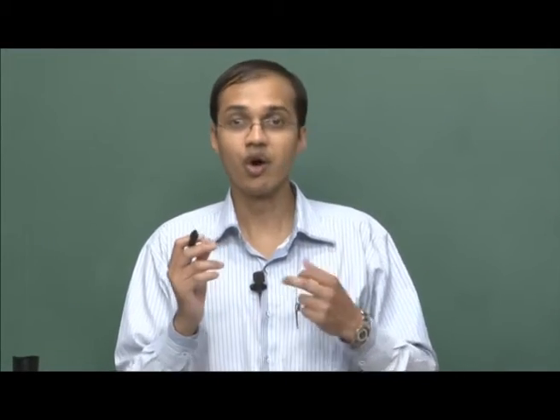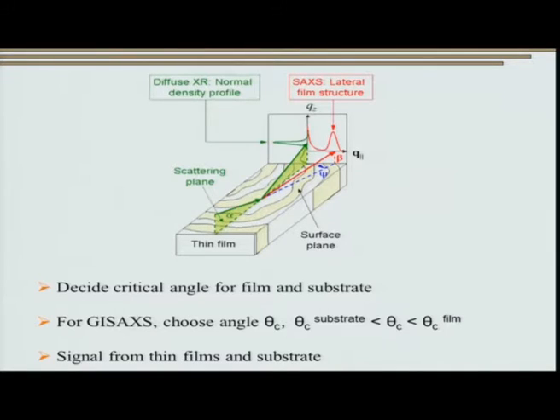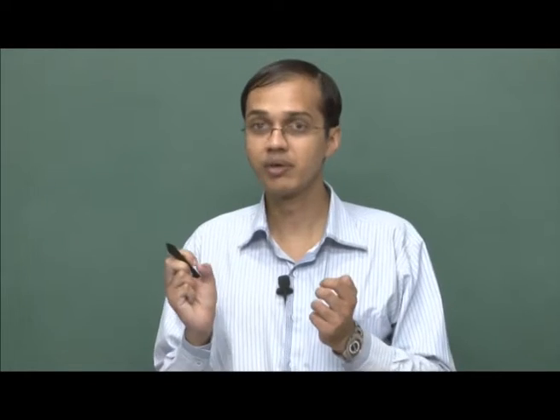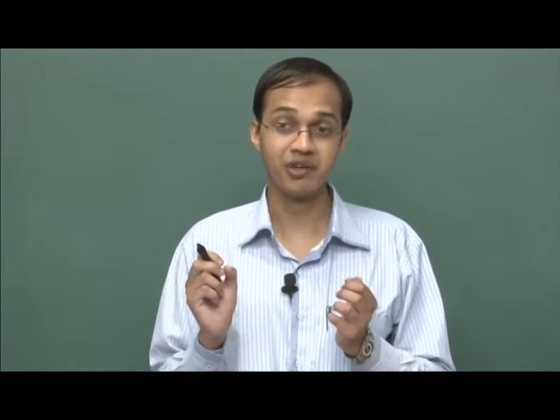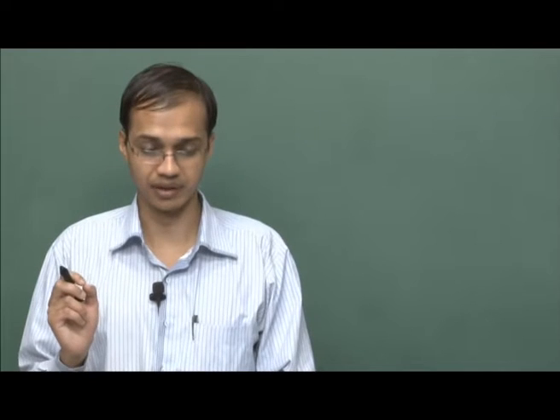So if you want to study the subsurface damage that is occurring due to implantation, you can always play with the incident angle, theta, so that we get information from different depths. This is one parameter which is used routinely to control the extent of information that we are getting during grazing incidence small angle X-ray scattering.